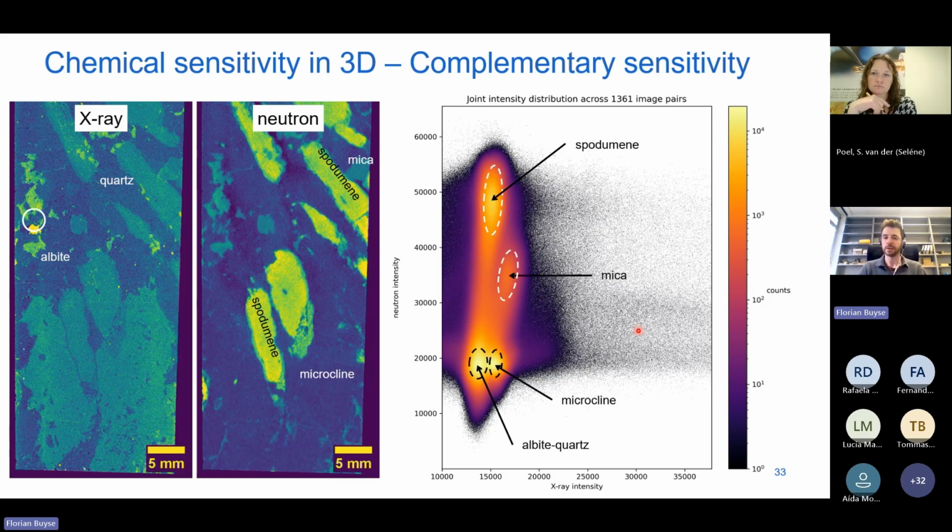The only problem with polishing is that it's not always even. Sometimes these edges can be not well polished, and there you have maybe a small difference in mineral composition. Of course, if you only select a zone, and those images are registered well, it is possible to use this.